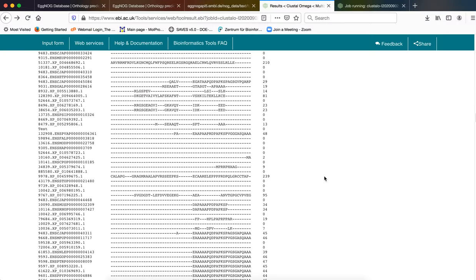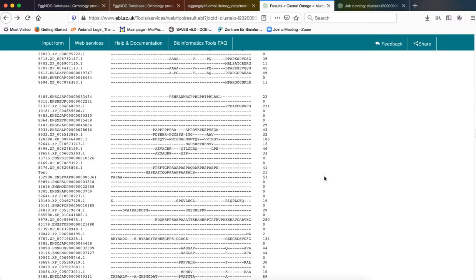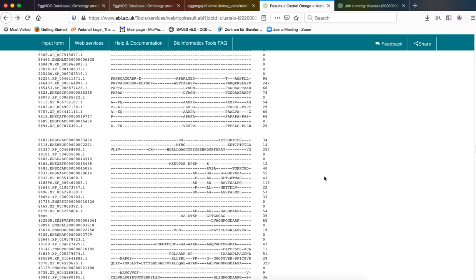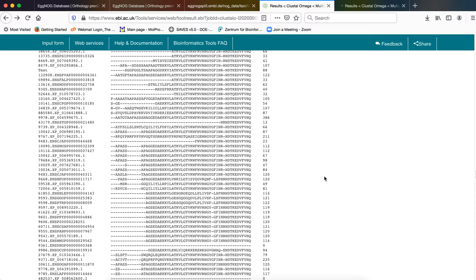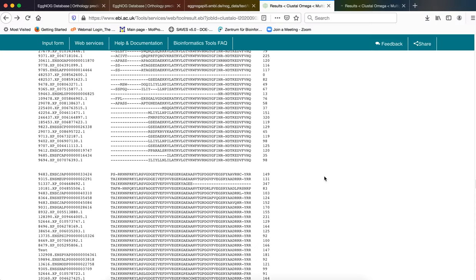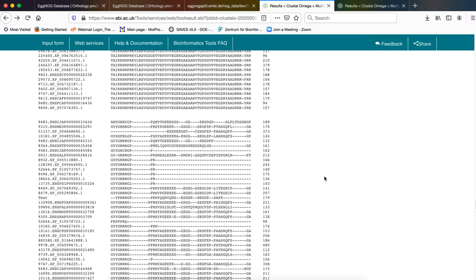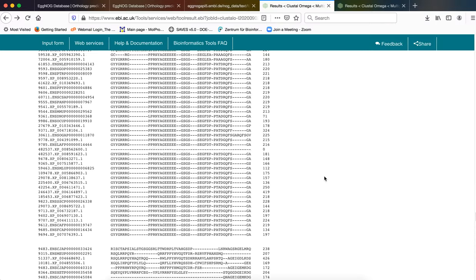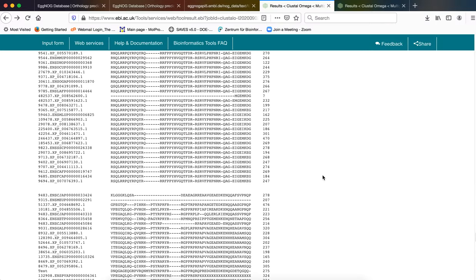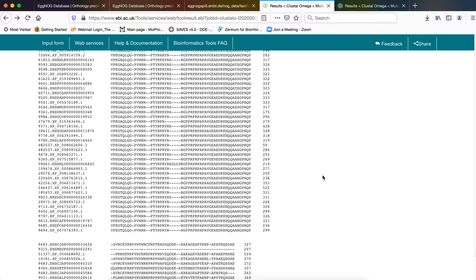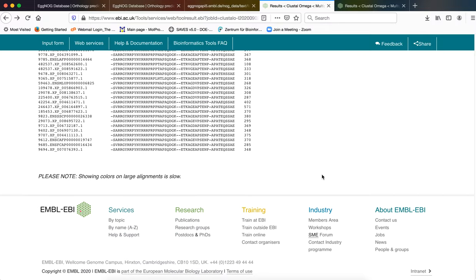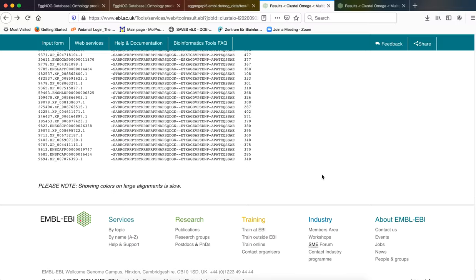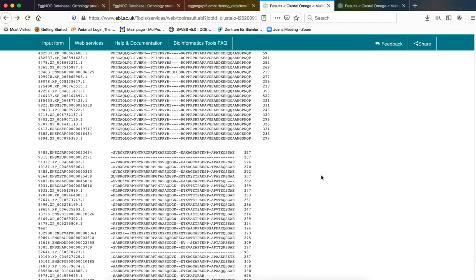This is your multiple sequence alignment that has been generated. As you can see there are several gaps and there are several areas which are conserved across the sequences under study. And probably the conserved areas are corresponding to the conserved domains that we have identified in our earlier analysis.